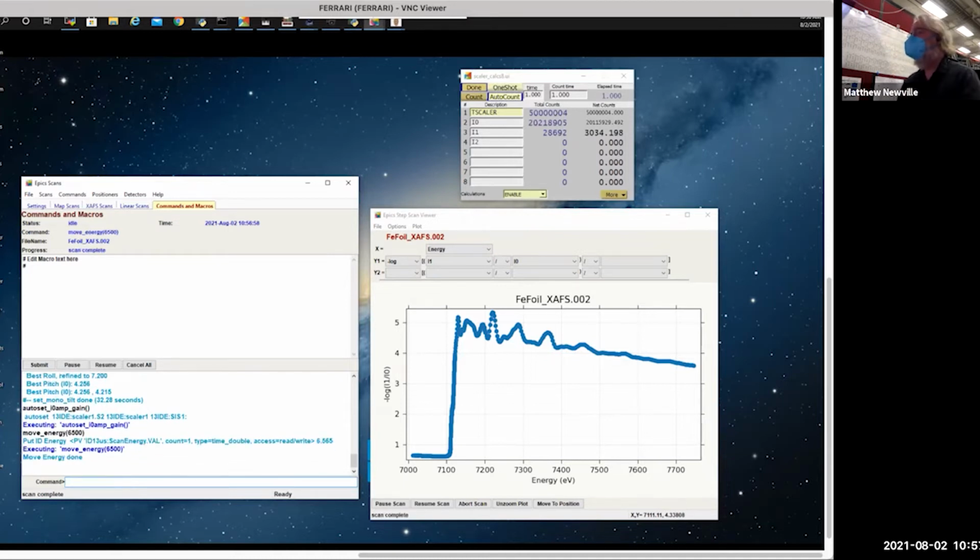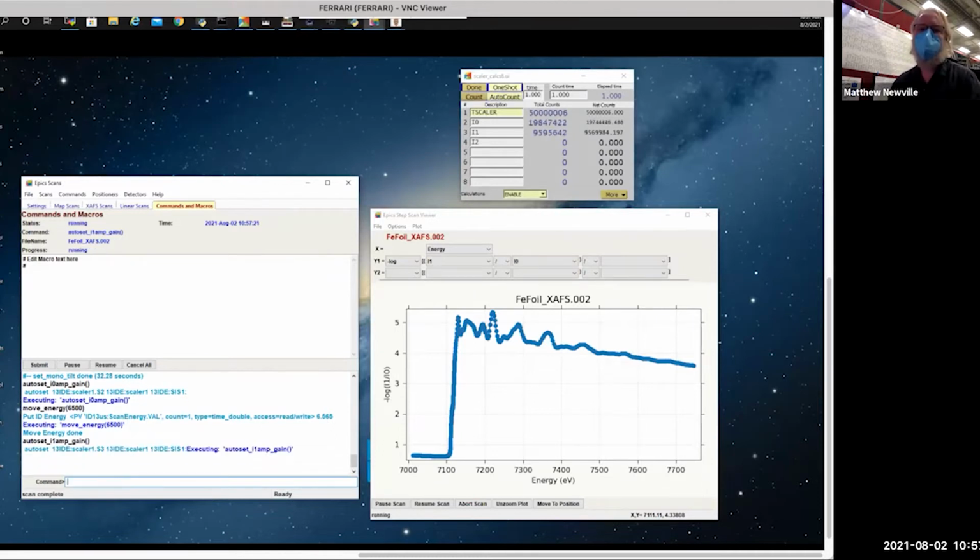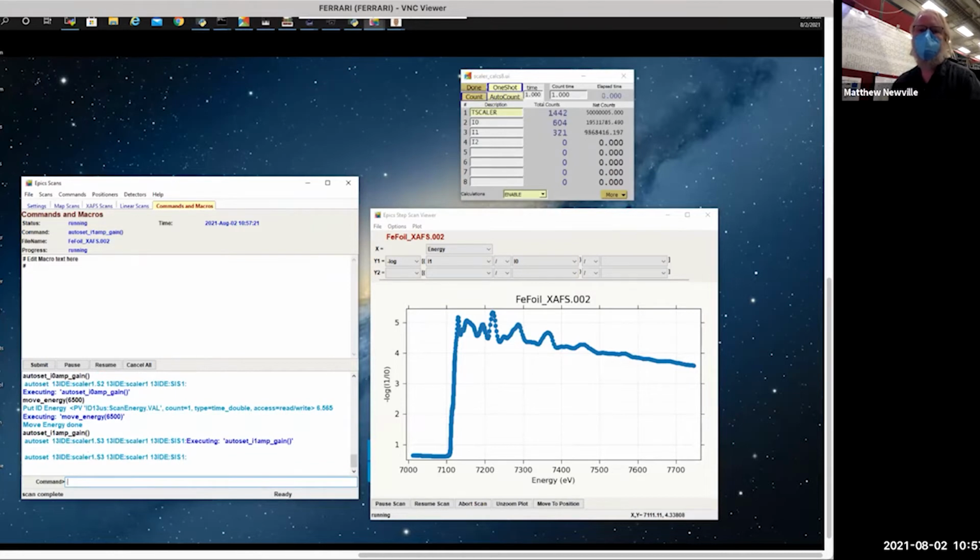And then look at the same thing for I1. Now I1 is 0.5 there, and I want that to be larger. So I'm going to do the same command, but for the I1 chamber, just to make sure that the ion chamber gain is as good as it can be, so the sensitivity is right for your manganese. And actually, it went up to 1 volt, which is good enough, and now it's collecting the offsets automatically, and then you'll be ready to do that scan.